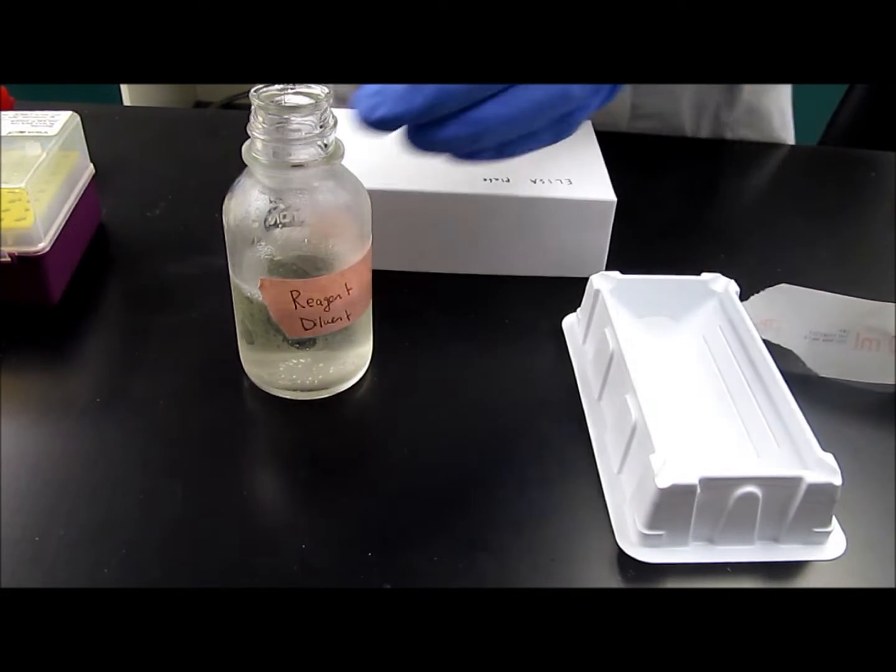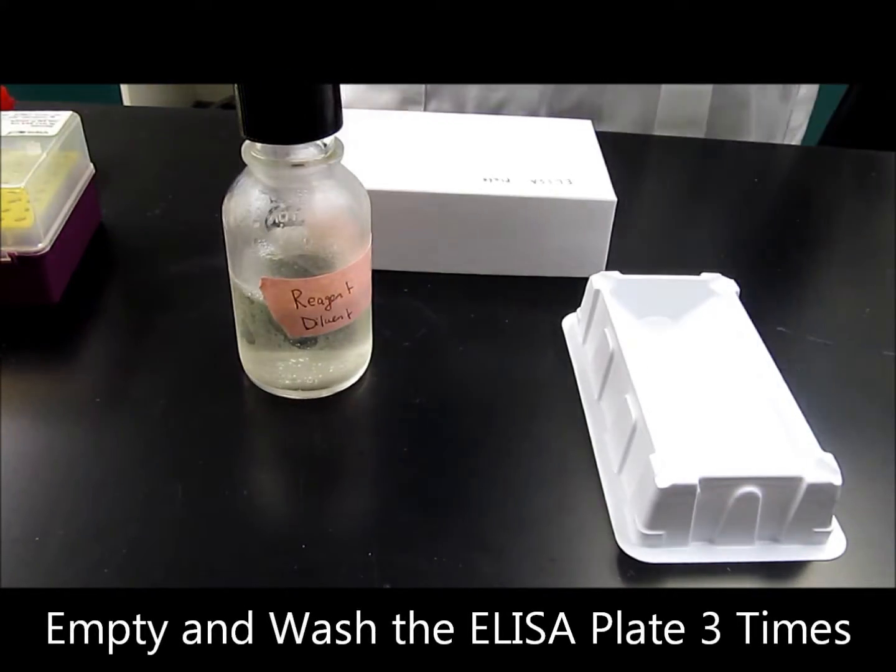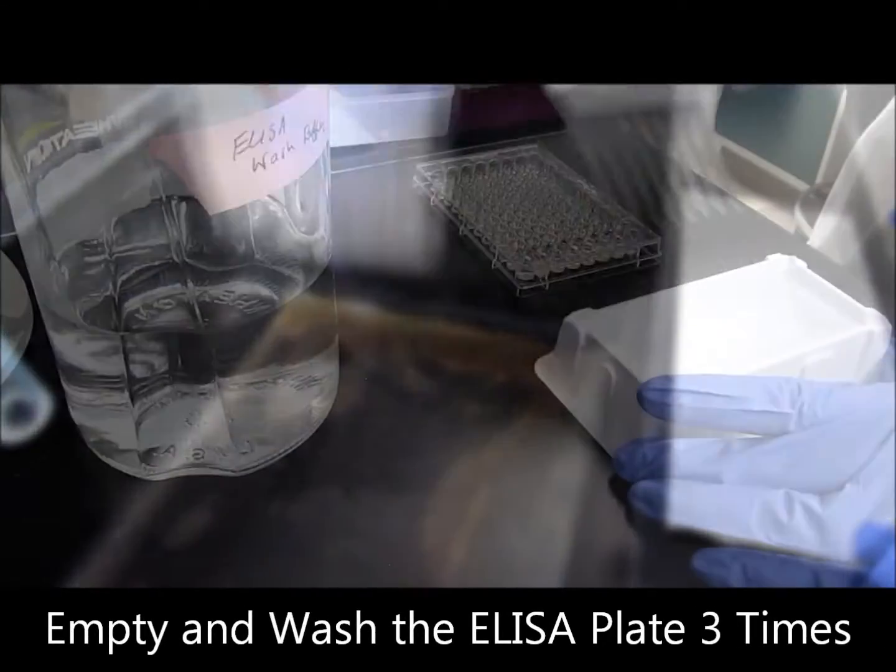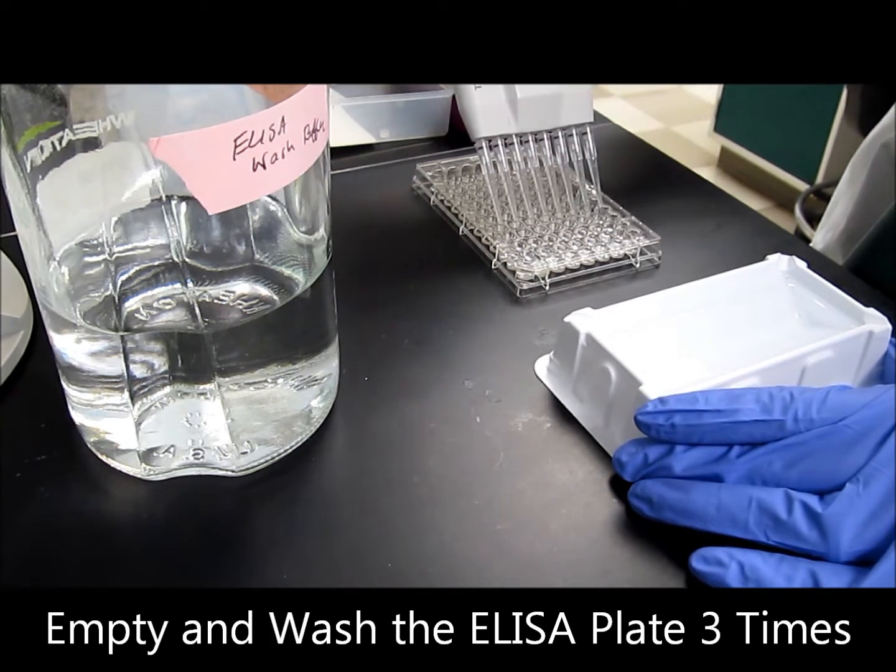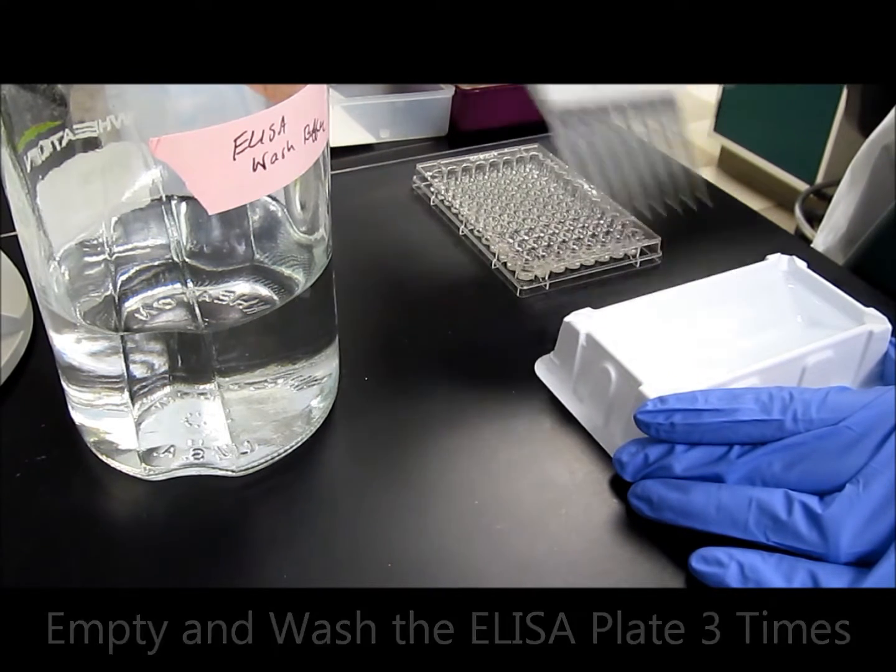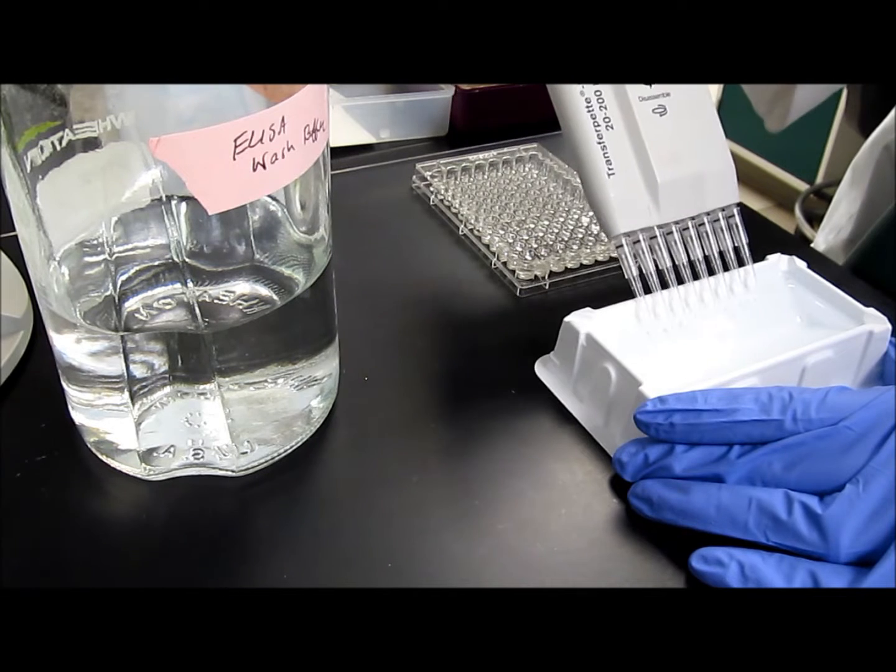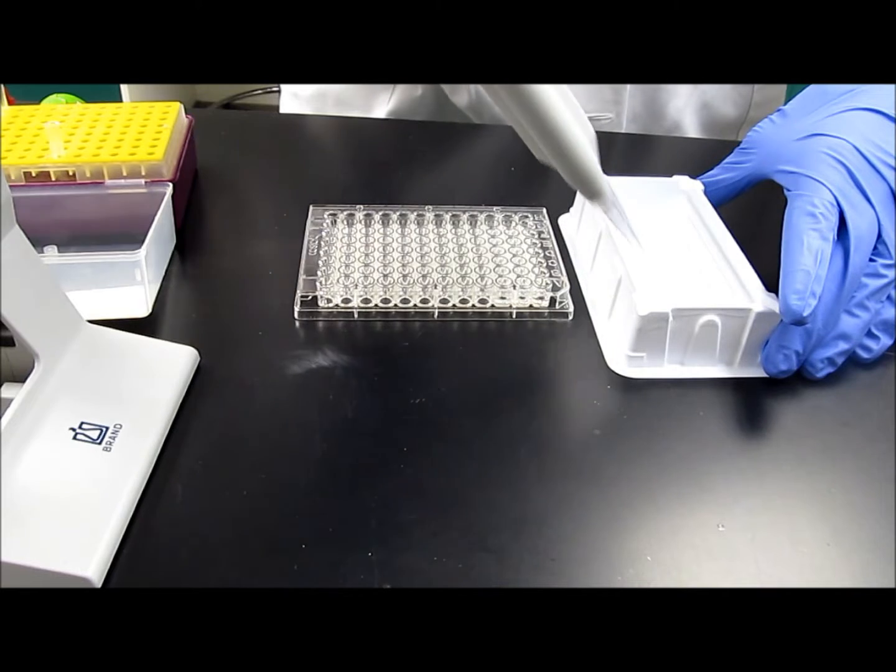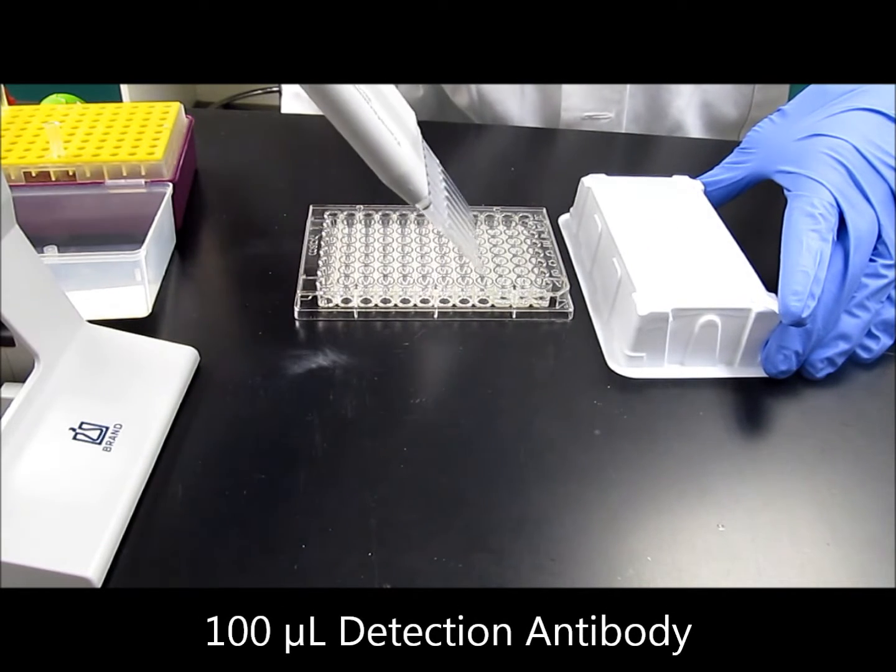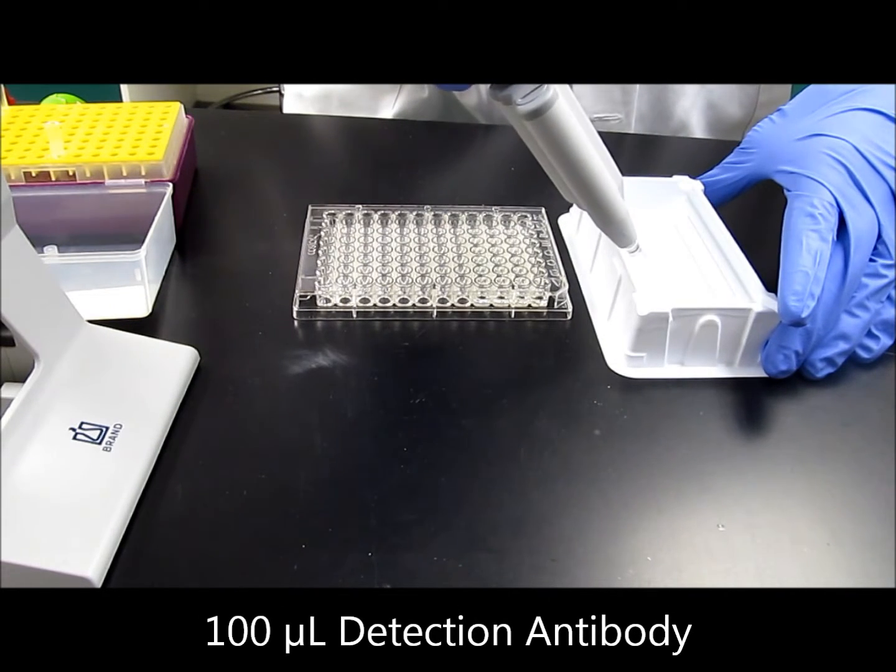Once the diluted detection antibody is ready, empty out and wash the ELISA plate 3 times with 200 microliters of wash buffer as described before in our earlier ELISA tutorial video. The washing step is important because it removes any unbound sample protein from the wells of the ELISA plate. After finishing the wash steps, add 100 microliters of detection antibody to each well of the ELISA plate.